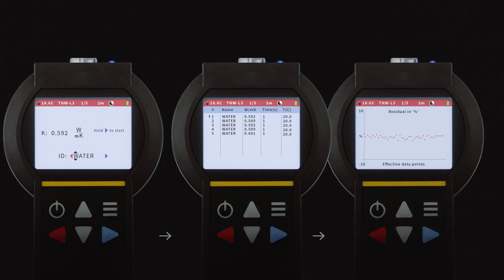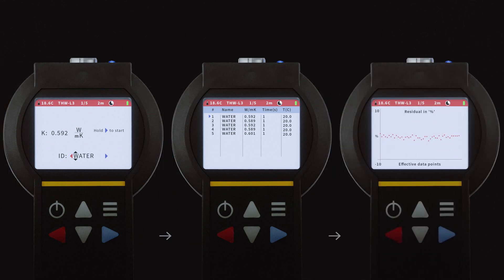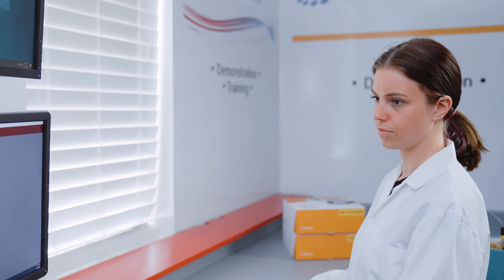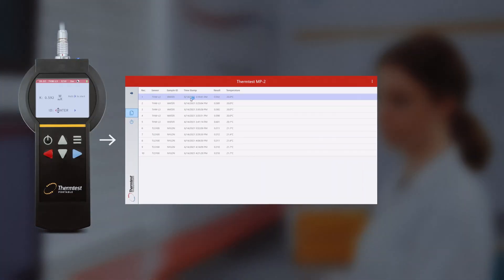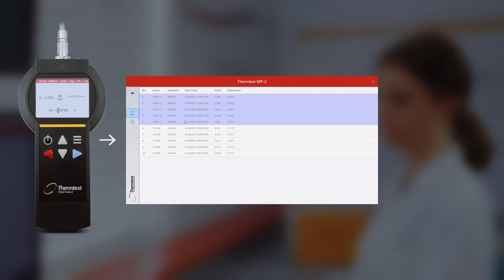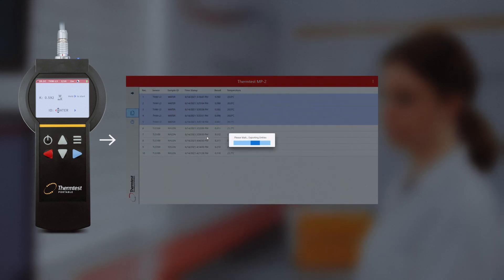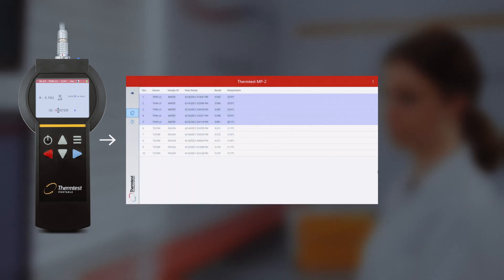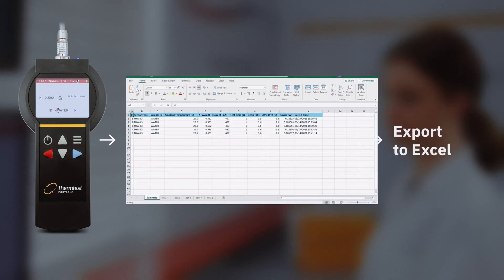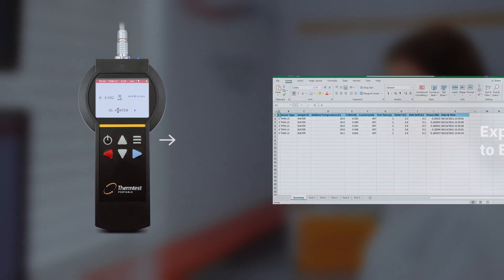Results, raw data, and residuals may be reviewed on the MP2 or transferred to a computer. The Windows utility program allows convenient transfer and review of testing results. Advanced features include the ability to review, save, delete, and export results to Excel.